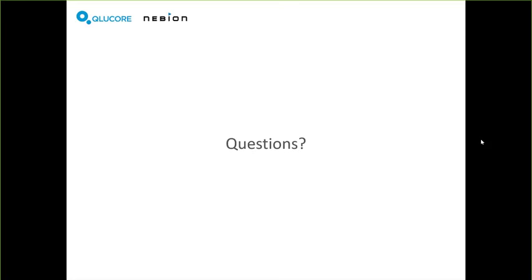So the first question here is: is Genvestigator limited to human studies, or can it handle other species? That's a good question. What we showed you now was human studies, but it also contains data from a lot of different mouse models, for example. It also has rat studies, quite some tox studies, and a couple of other model organisms as well. But mainly, most of the data is human and mouse.